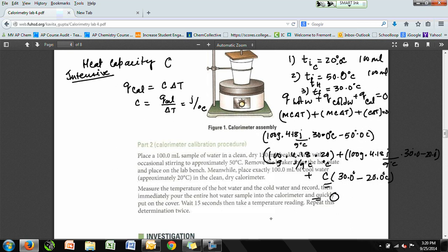The ideal range for heat capacity is between 15 to 35 joules per degree Celsius. But I will accept little variation in this because I understand that you are coming from different places. I thought this calculation will help clarify some of the confusion.